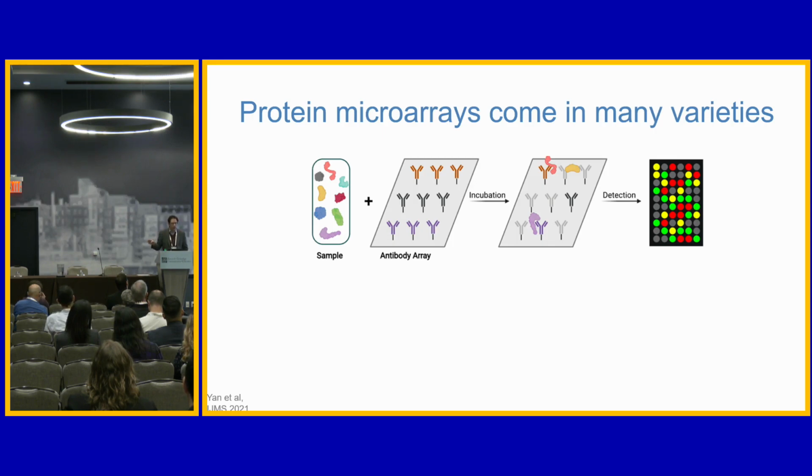Again, you have the same kind of constraints with washing and making sure your quality is good. Typically, these assays can work around 1,000 proteins, as opposed to SomaMers, where I think 11,000 were reported, and Olink has somewhere around 5,000 to 6,000 proteins being used.